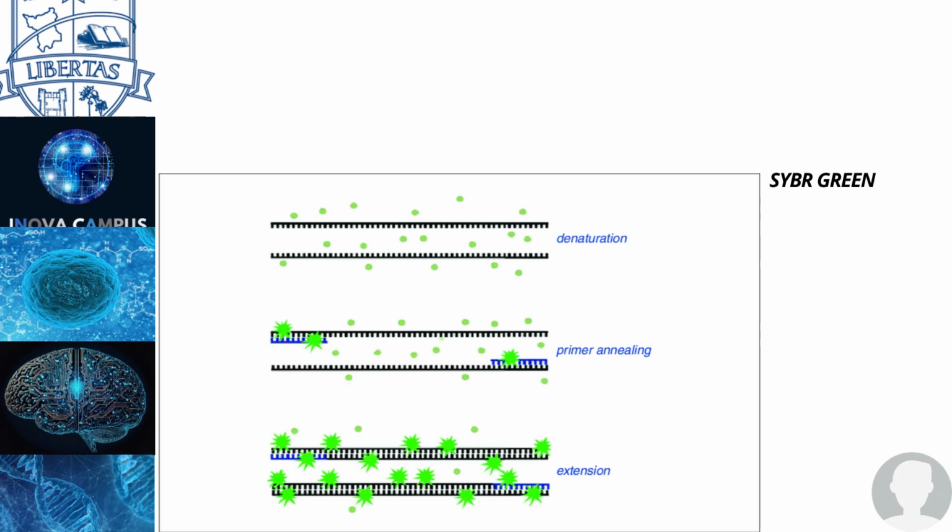Then we're gonna use the primer, like I said, and then DNA polymerase comes in, seals the thing, and when this marker detects a double-stranded DNA gene that we specifically marked for, it will bind itself to it and it will glow.